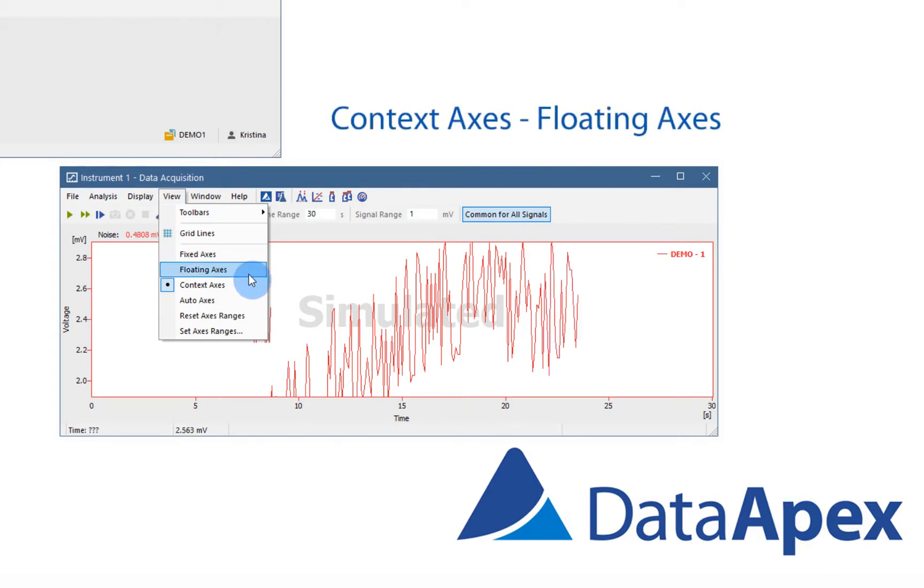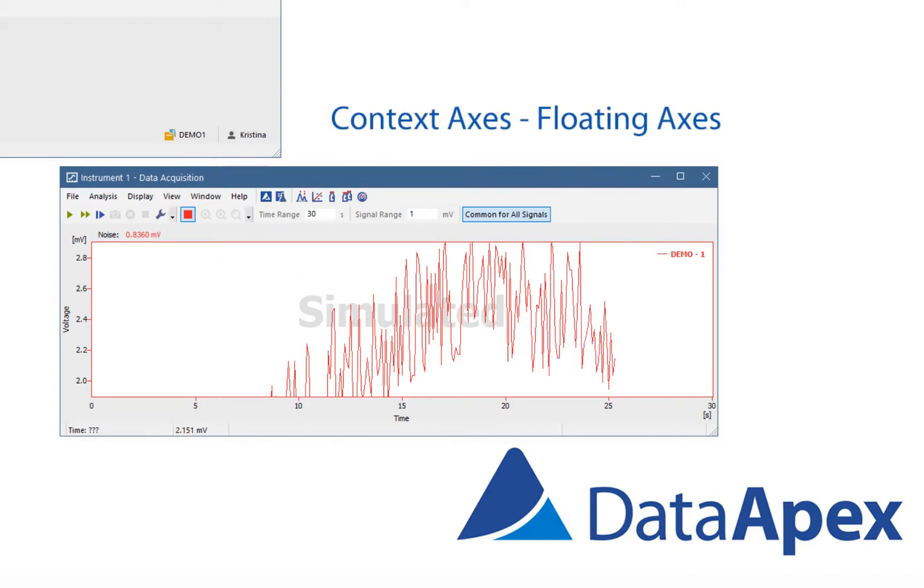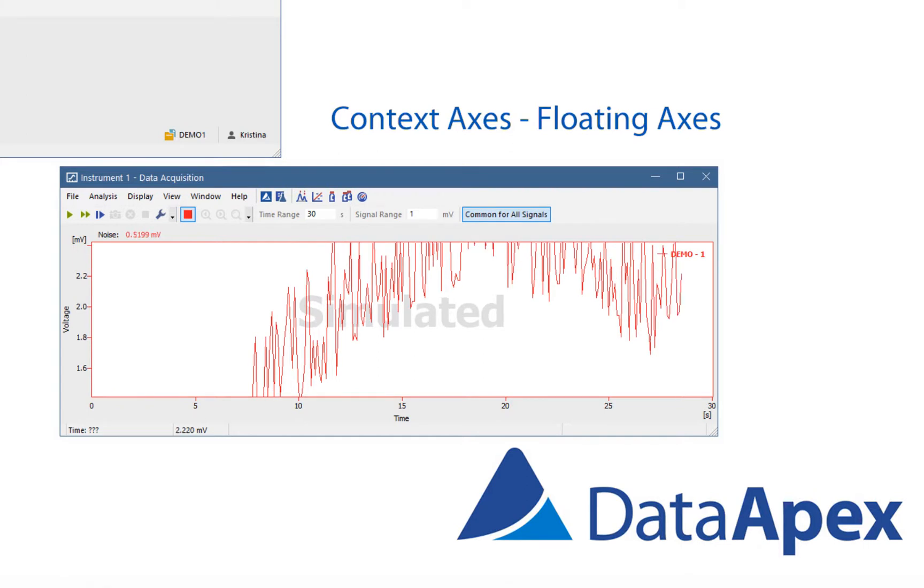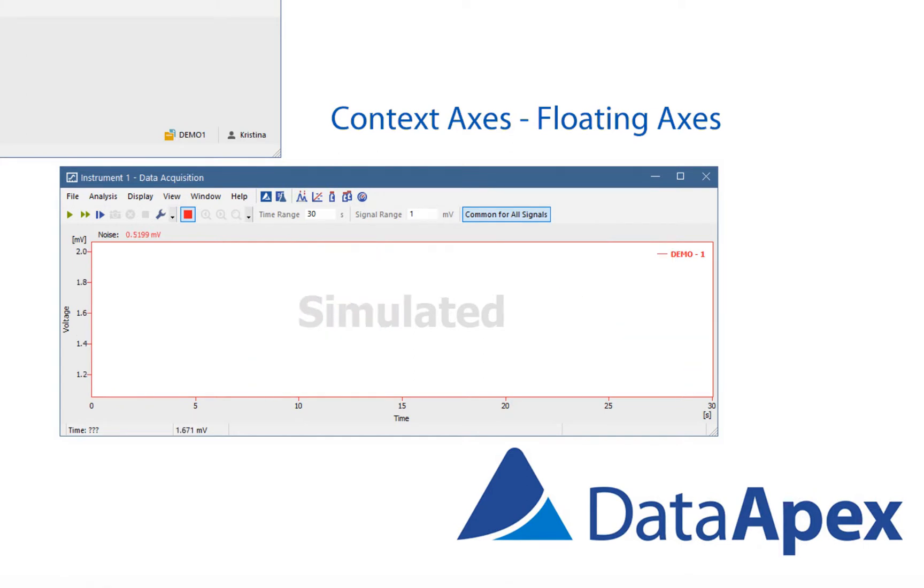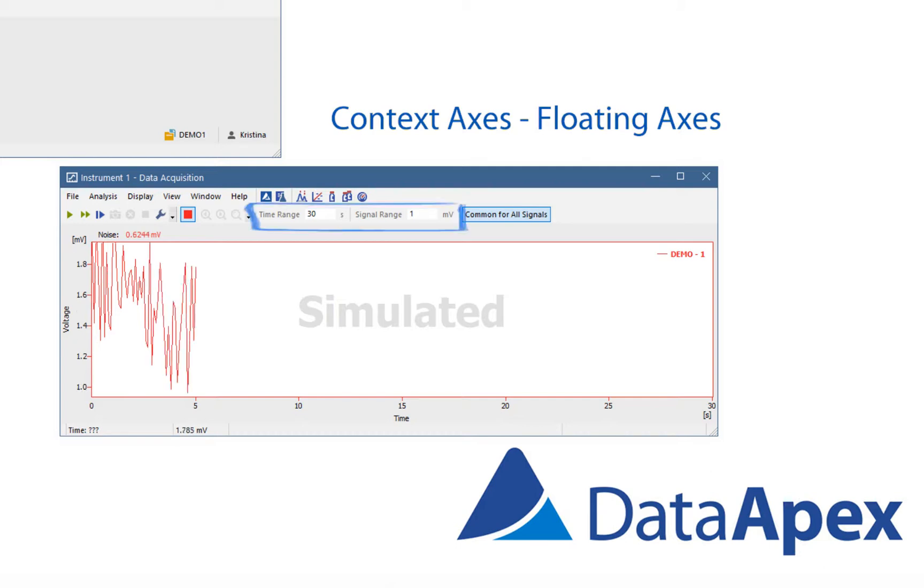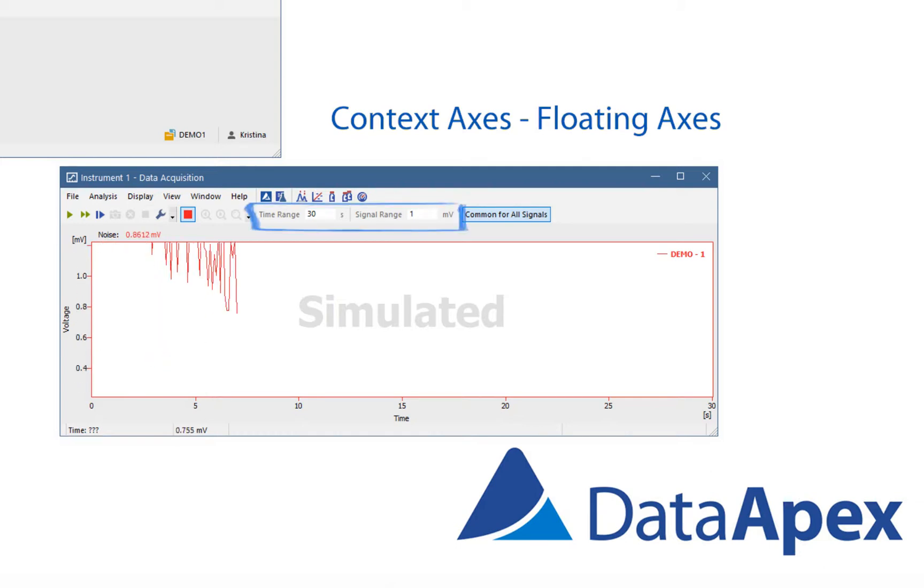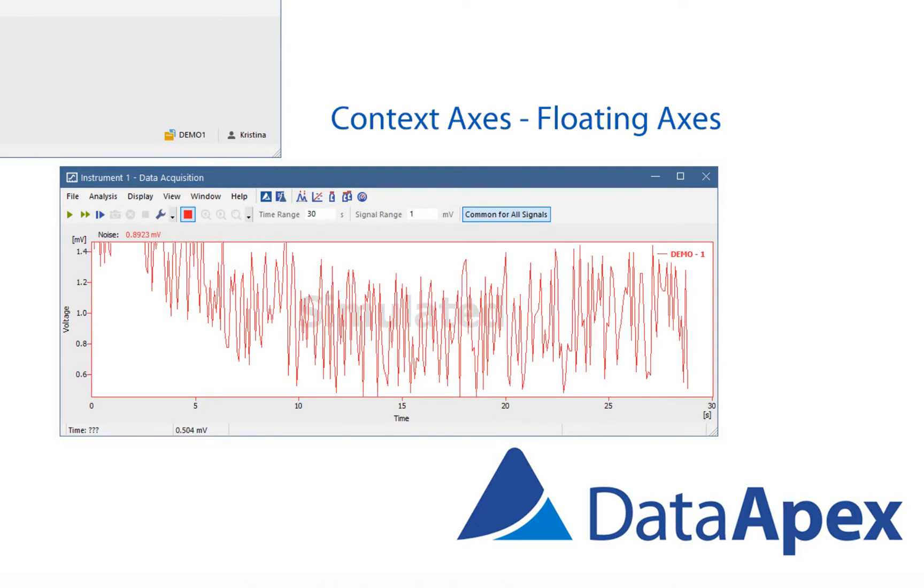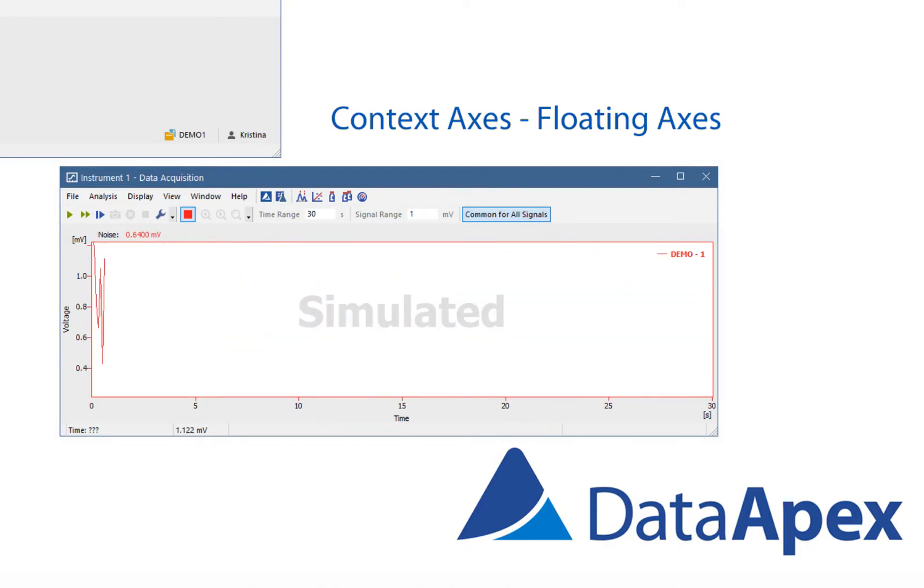Floating axis is selected when the instrument isn't running and we are monitoring the baseline. Signal is automatically vertically centered and displayed in relative ranges based on the fields above the area for signals. When the signal reaches the end of the graph area, the signal returns to the start again.